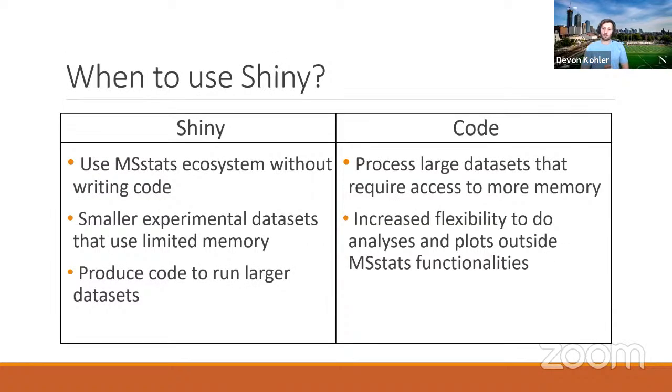Okay. So I wanted to give an overview of when you'd use Shiny versus using the code. So when would you use Shiny? The main idea is to use the MSstats ecosystem without writing code. Like I said before, maybe you aren't familiar with R or aren't familiar with coding. You can use the Shiny app and run an MSstats analysis the exact same as someone who would be able to write the code.